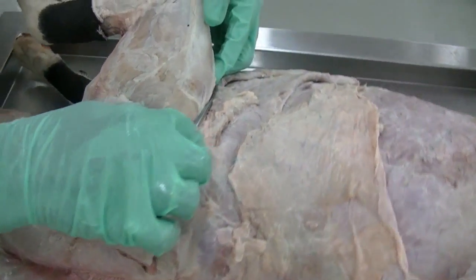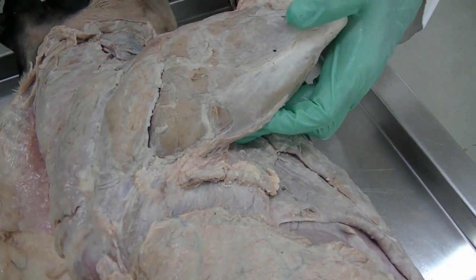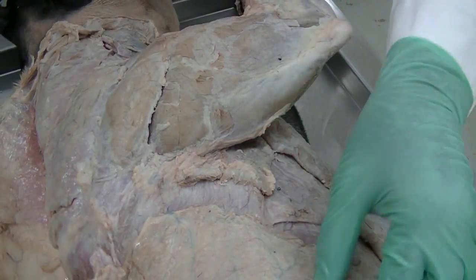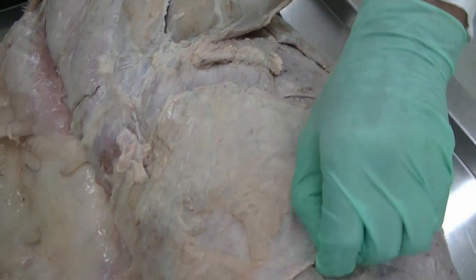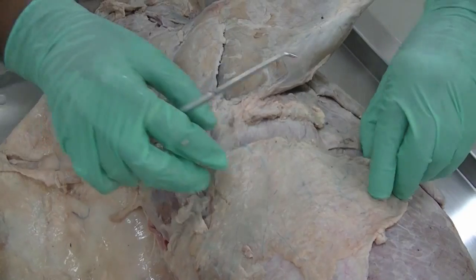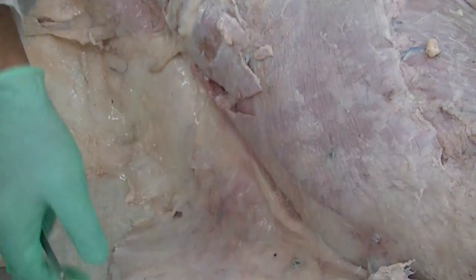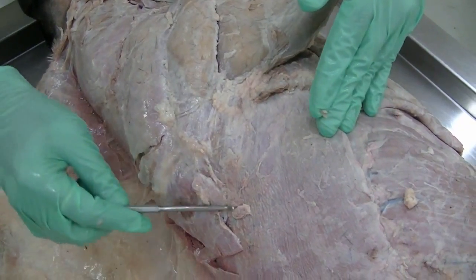Further, it will go deeper on the medial aspect of the humerus to get attached to the bone, and that is the only site where it attaches to the bone. The rest of the muscle is widespread on the trunk and is more associated with the skin. As we reflect the cutaneous trunci, we now expose the extrinsic muscles of the forelimb.